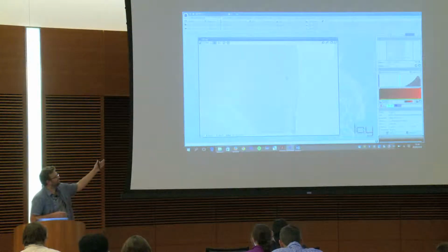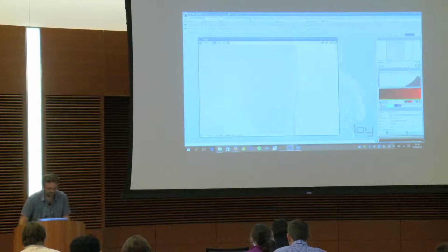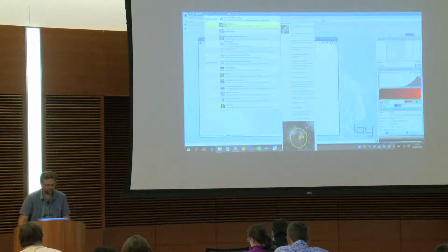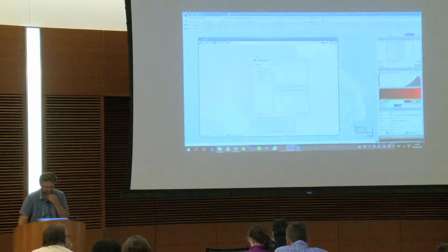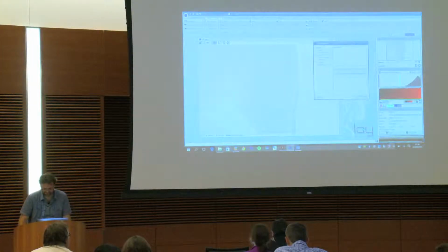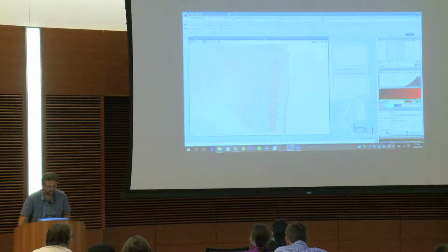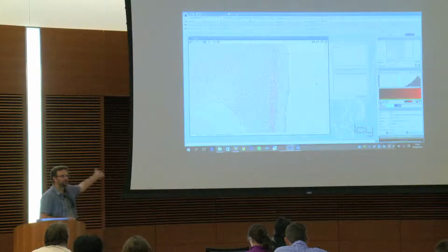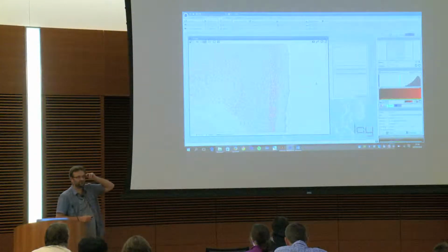So the first thing in here is that I will use a plugin that is called the spot detector. I made it, but you will see, I will say it's not a good one. So I'm forgiven. And then I start the detection. It works because, in fact, at the beginning, I had this image to work with, so the parameters are good.